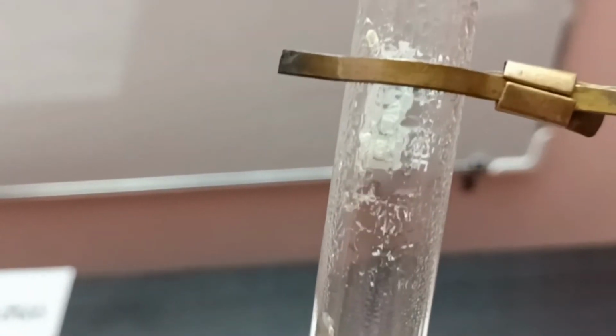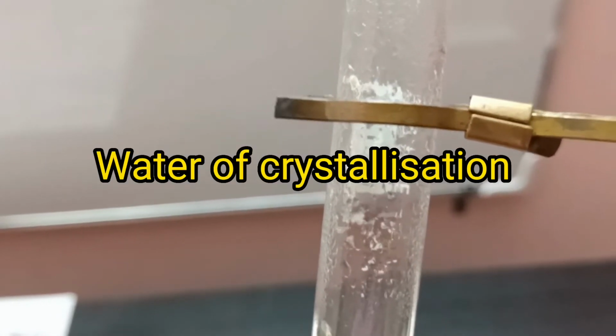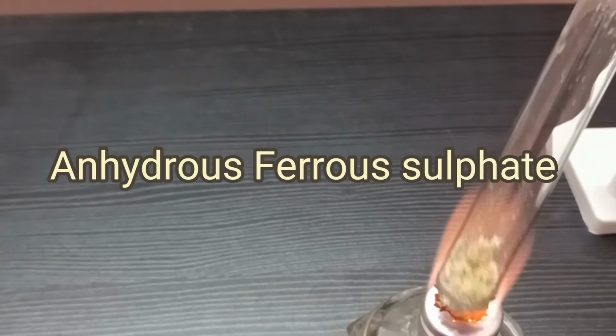This is a physical change. As you know, you can see water molecules evaporating from the crystals and the water vapors condensed on the sides of the test tube. This is the water of crystallization. This is a physical change. Now ferrous sulphate is becoming anhydrous. That means it loses water of crystallization. And we need to continue heating.